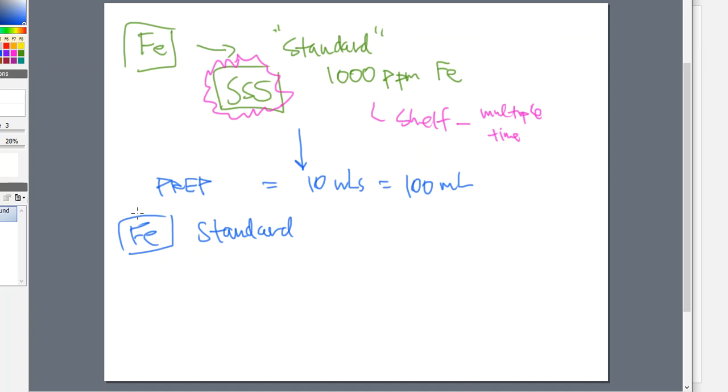Okay. So if I make that sample, I have just basically diluted it. I have a really strong sample up here, concentration-wise, 1,000 ppm. And 1,000 ppm is often too strong. Way too strong to do things with. We work with much lower concentrations than that. And keep in mind, 1,000 parts per million means 1,000 milligrams per liter of solution. I mean, that's quite a bit, right? So 1,000 milligrams in 1 liter dissolved is way too strong for our instrumentation, most likely in an analytical lab.